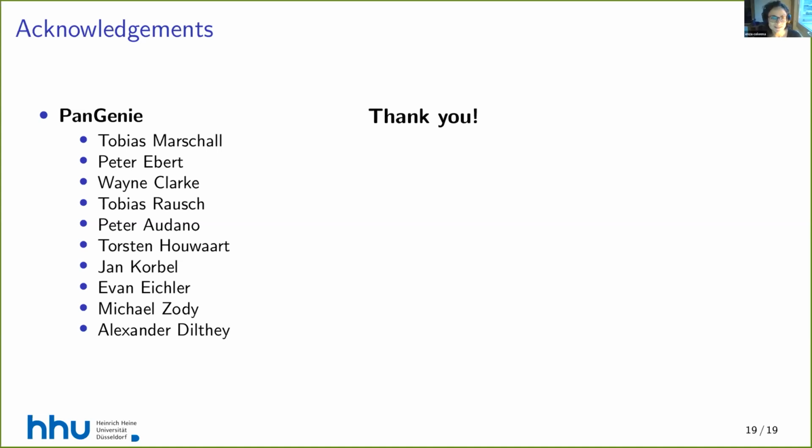All right, and then there's a third question from Luca. It says, maybe I missed this too, mapping-based approaches can discover novel variations. Did you consider them in your benchmarking, and how? So for our benchmarking, we only considered the re-genotyping. We did not consider discovering new variants, because not all tools can do that. And this is why we skipped those variants.